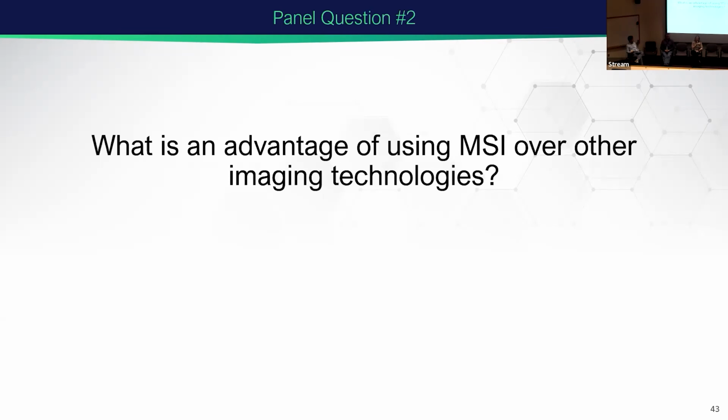I think one thing is your depth of coverage. A lot of times, if you're looking at something like MALDI or a surface sampling technique, you often don't have that extra separation. So something that's really low abundant might not be detected with enough confidence for you to report. But the technologies have evolved. We mentioned ion mobility mass spectrometry.